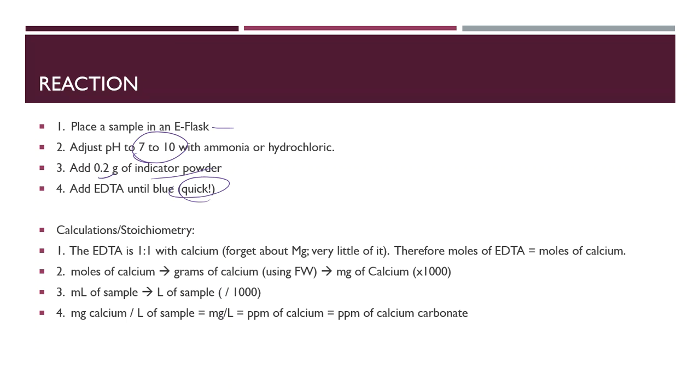And we got to go pretty quick about this. We don't want to just wait forever. When we add that, when we get it ready, we want to titrate it as soon as possible. So prep these samples as you go. Do not prep all of them that you need to titrate and then titrate them all at once. You really do want to titrate them as soon as you can, lickety-split.